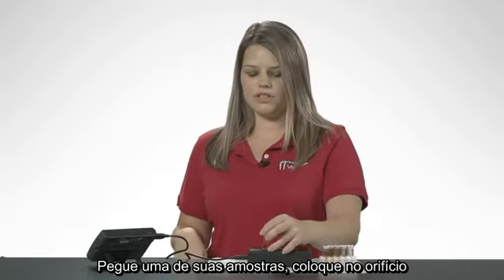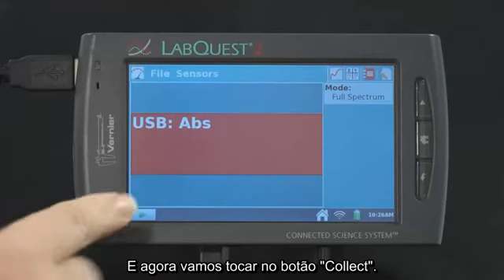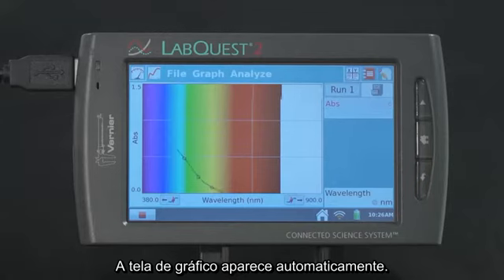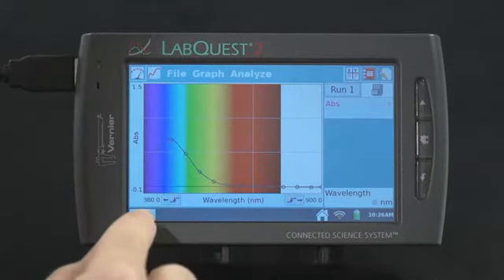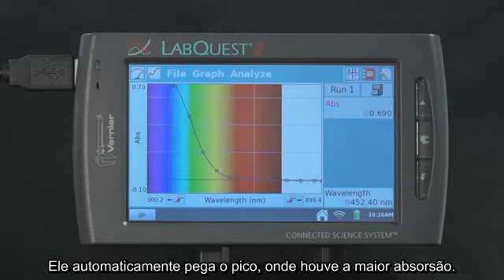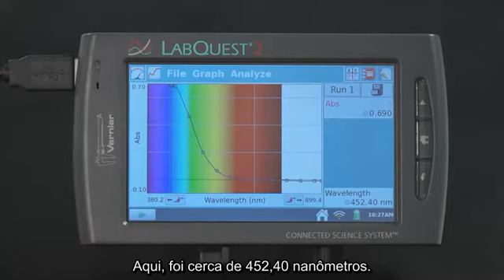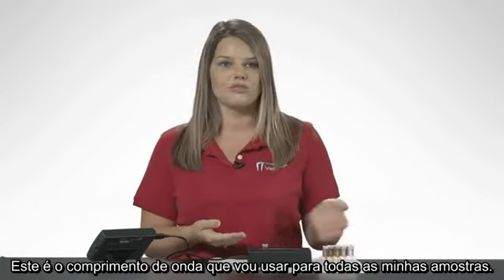Pick any one of your samples and put it in the path length, and then we're going to tap on the Collect button. The graph screen should automatically show up, and you should see the full spectrum. I will have to press stop once I've seen the full spectrum, and it will automatically pick the peak that has the highest absorbance value for me, which is around 452 nanometers. This is the wavelength that I want to use to determine the absorbance values for all of my samples.